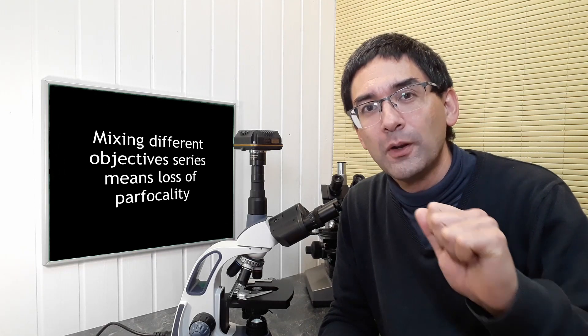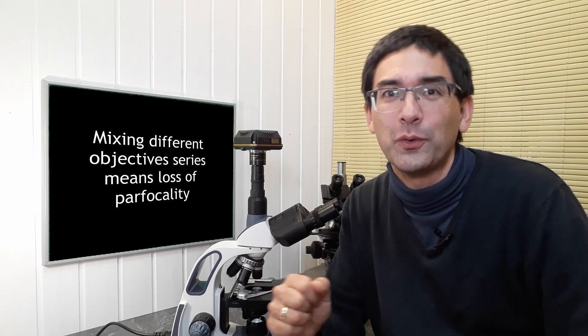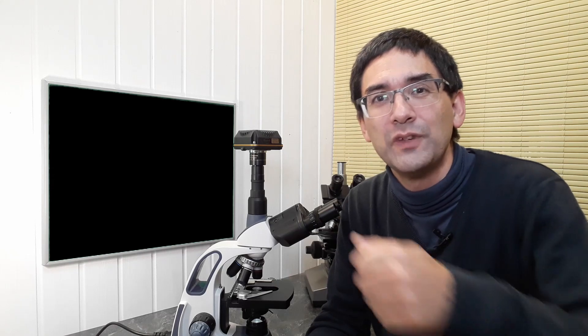And this means that if you switch objectives from 40 times to 60 times, you lose focus and you have to refocus. And that is a problem sometimes because in this case it was possible to refocus because I had to then raise the stage a little bit so the distance was actually too large. That's not a problem really, but what happens if the distance is too short if it's the other direction? You risk hitting the stage or the slide rather when you're changing in the other objective if there is no parfocality.